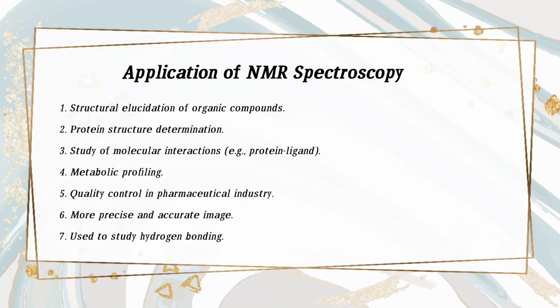Application of NMR spectroscopy. Structural elucidation of organic compounds. Protein structure determination. Study of molecular interaction. Metabolic profiling. Quality control in the pharmaceutical industry. More precise and accurate images are used to study hydrogen bonding.